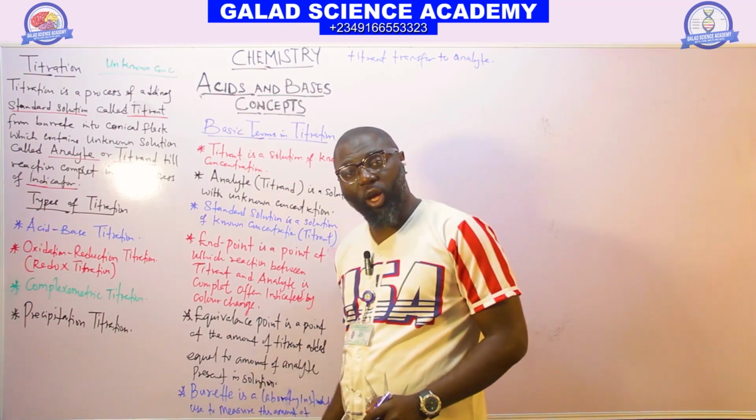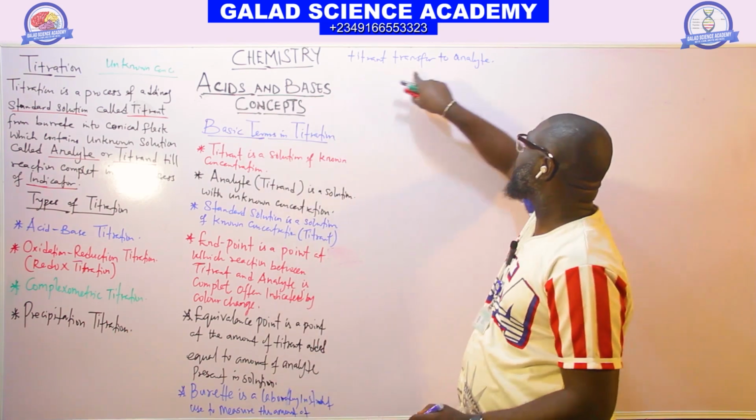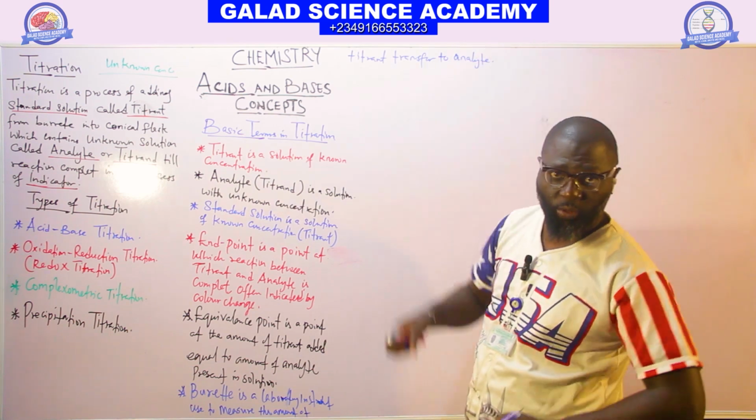We use the burette to measure the amount of titrant transferred to the analyte, which is of unknown concentration.